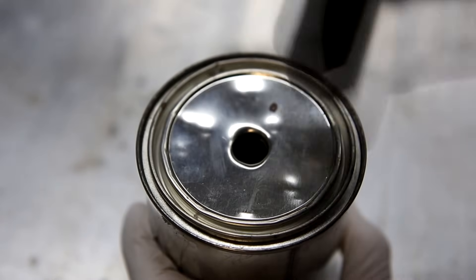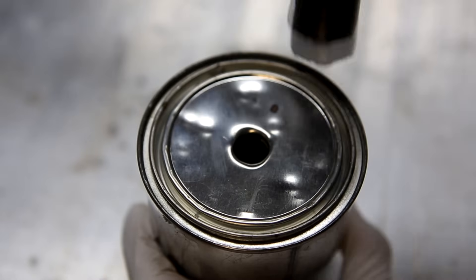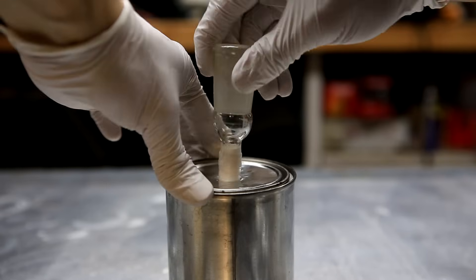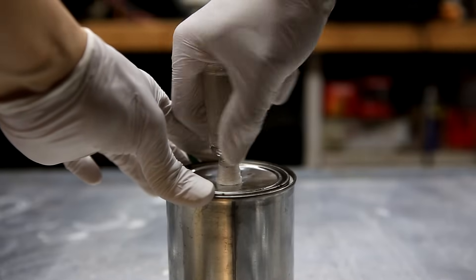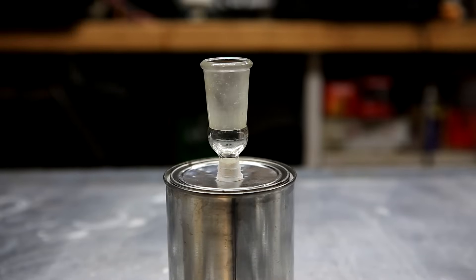This hole was made by simply hammering a screwdriver through the lid. Then a glass adapter with a generous amount of teflon tape was stuffed into the hole. It was made sure that the seal was as tight as possible.